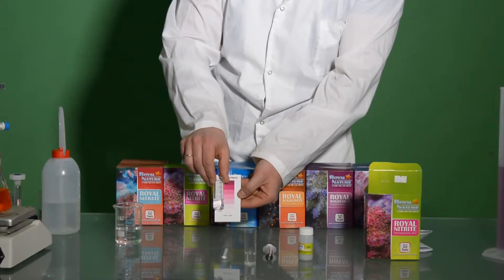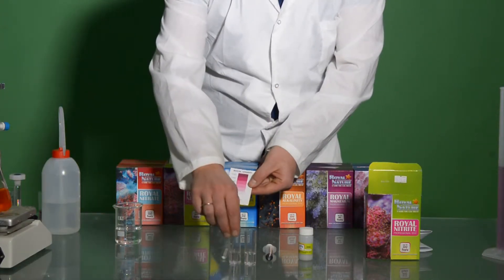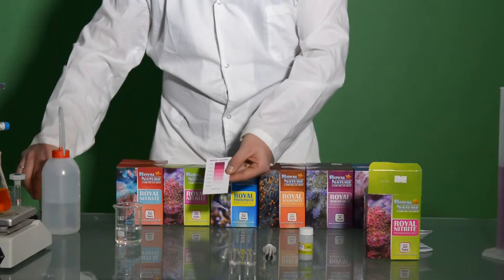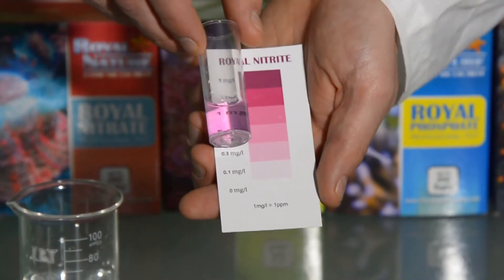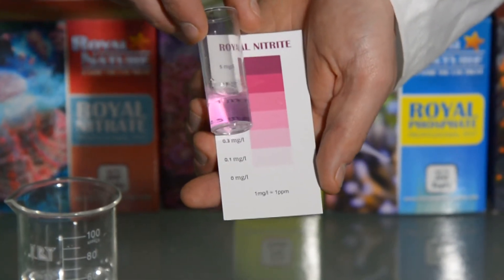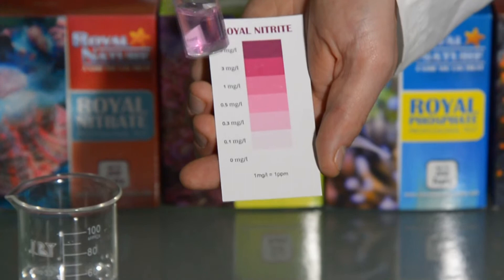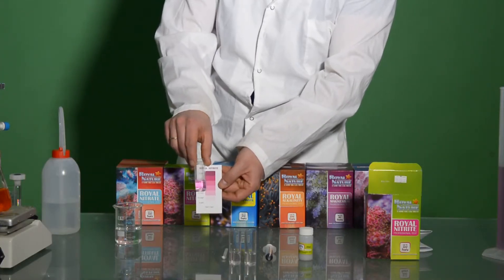That was prepared in the lab. We can see the color. The second one would be 0.5ppm. It can clearly be seen which is pink, and this is the color that you will find if you have 0.5ppm of nitrites in your tank.